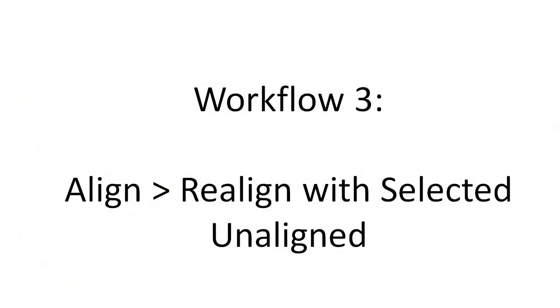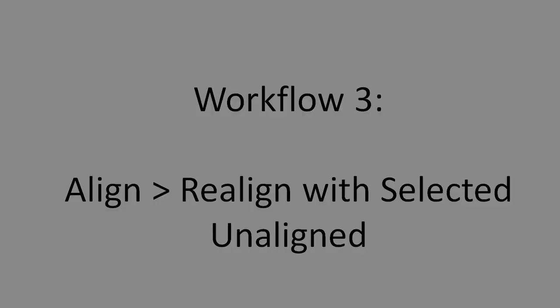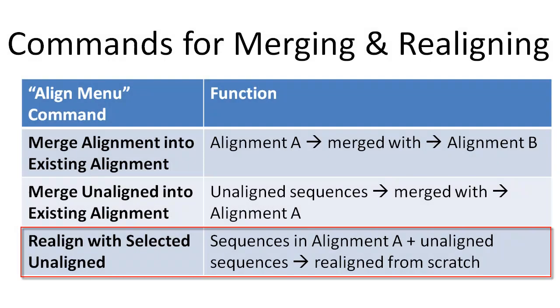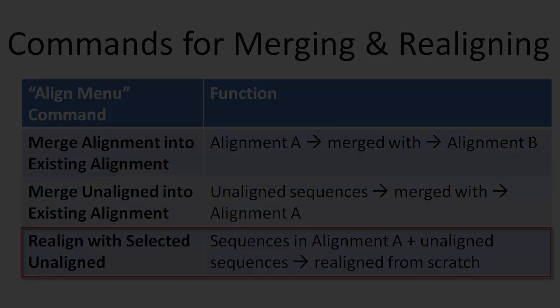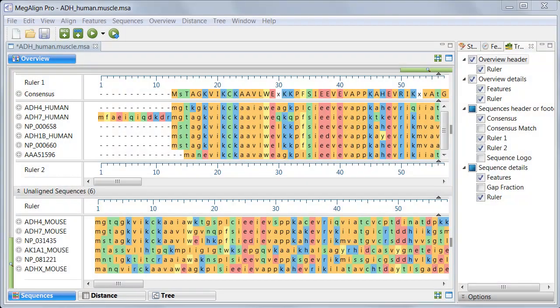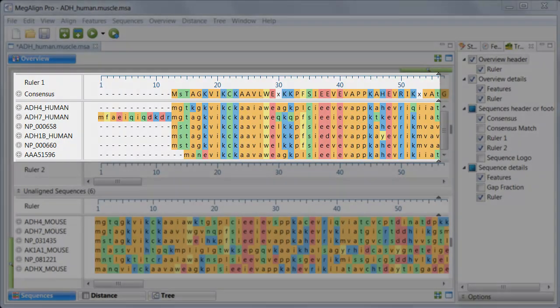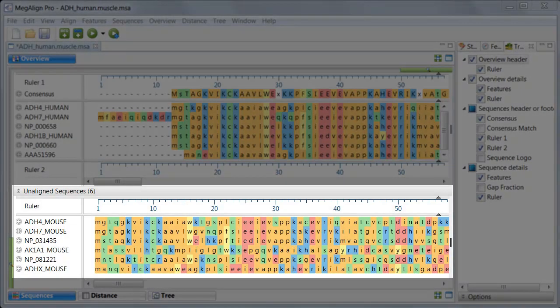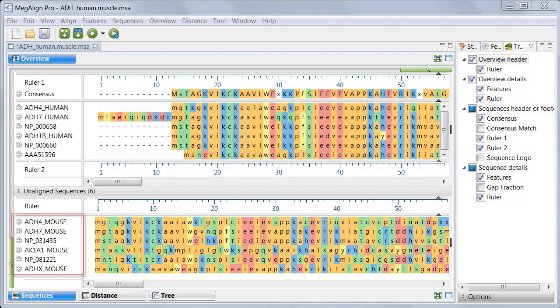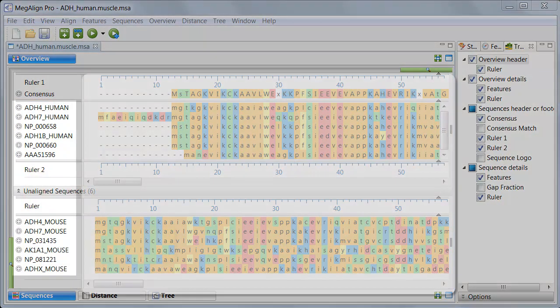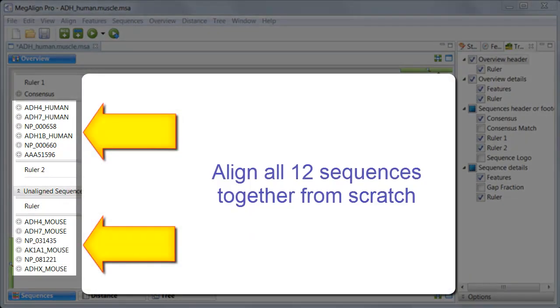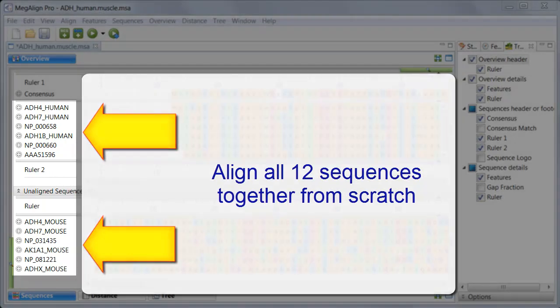In Workflow 3, I'll be using the Align, Realign with Selected Unaligned command. This command is used to completely realign the sequences in an existing alignment with selected unaligned sequences. My setup is identical to the previous workflow. I have a finished alignment for the six human sequences, and six mouse sequences in the unaligned sequences area. In the previous workflow, I merged the new sequences into the existing alignment. In this case, however, I want MegAlign Pro to make a completely new alignment from scratch.